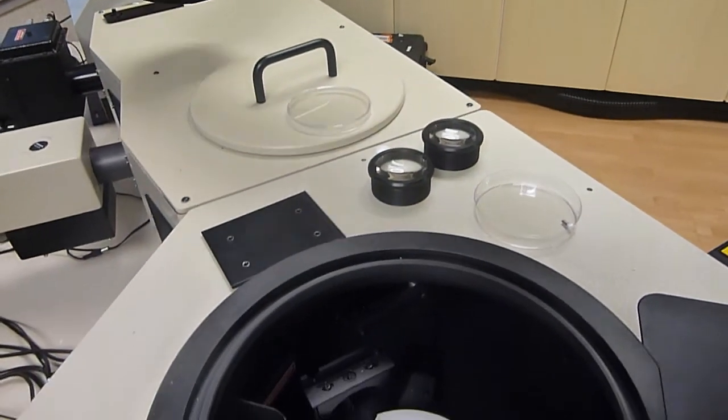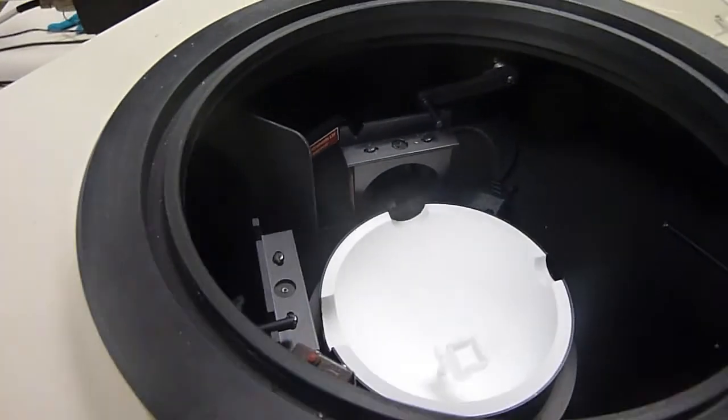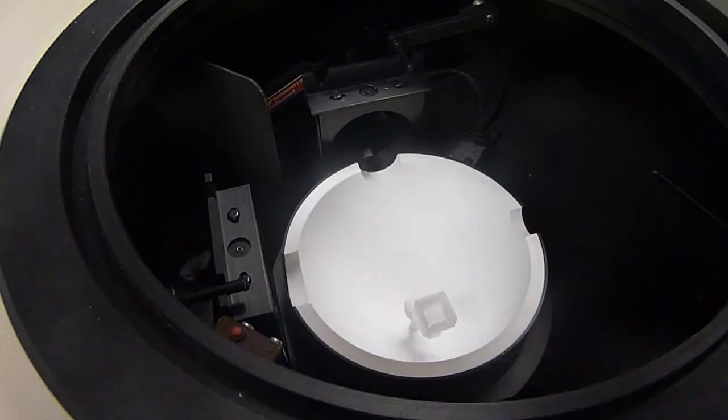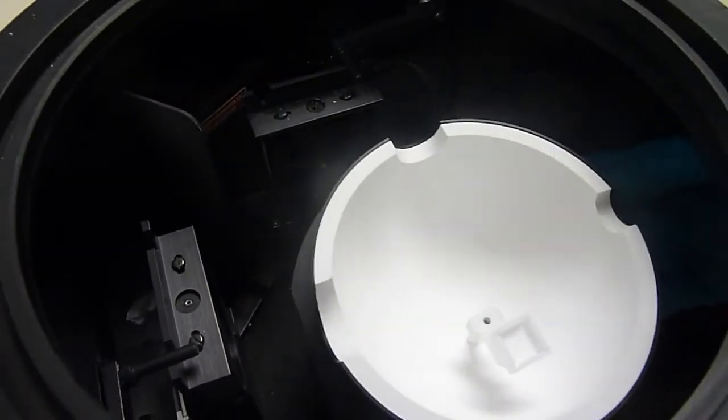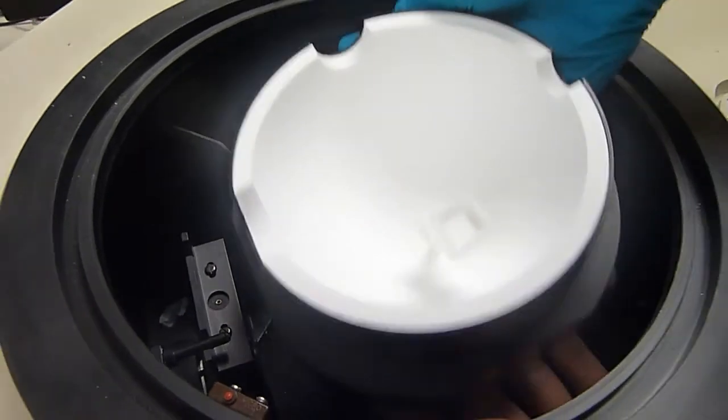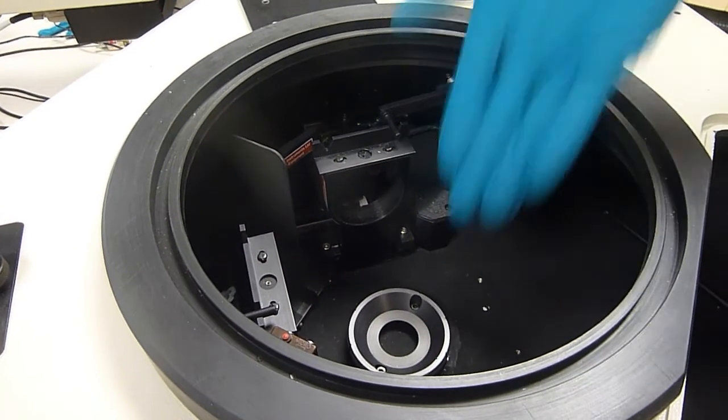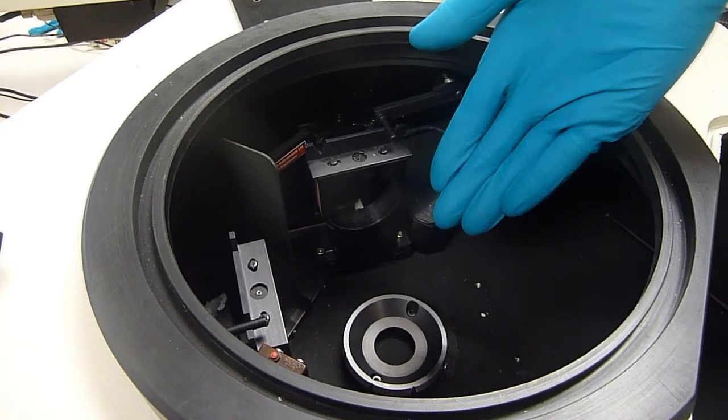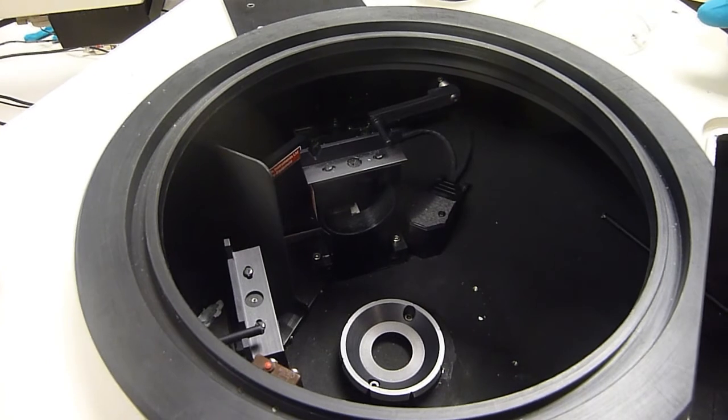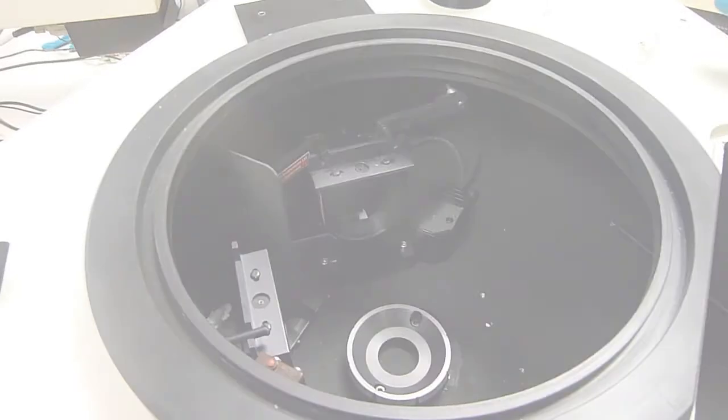When I'm not doing a quantum yield measurement I can then remove this integrating sphere very easily just by essentially taking this out. And then the sample chamber here is free to add in other sample holders. So that's a quick demonstration on how we do quantum yield measurements here at Edinburgh Instruments. Thanks very much.